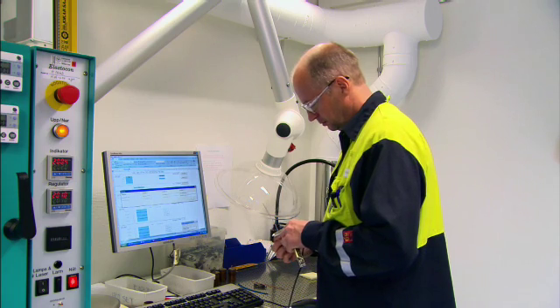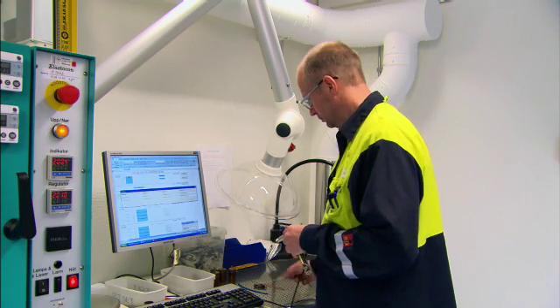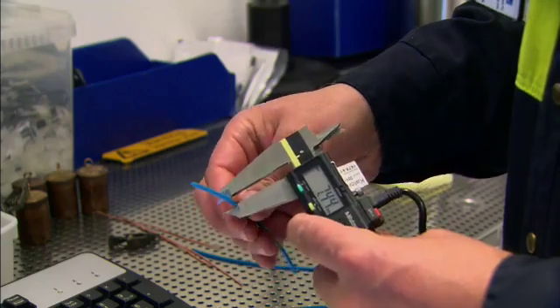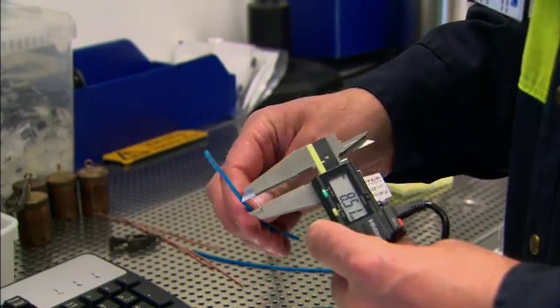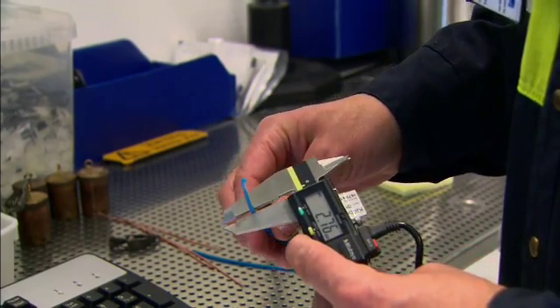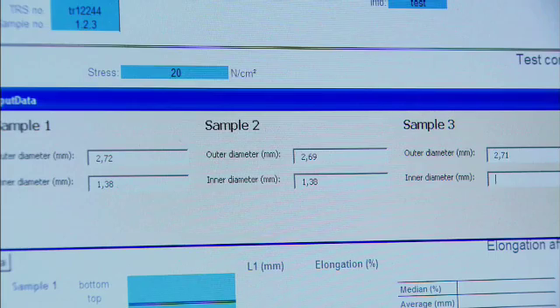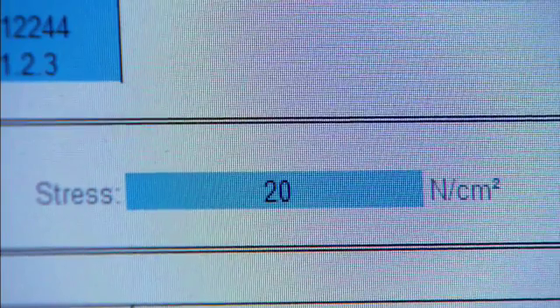Measure the cross-section area and calculate the weight. The mechanical stress that has to be applied to the sample during the test is specified in cable standards. In most cases, this is 0.2 megapascals.